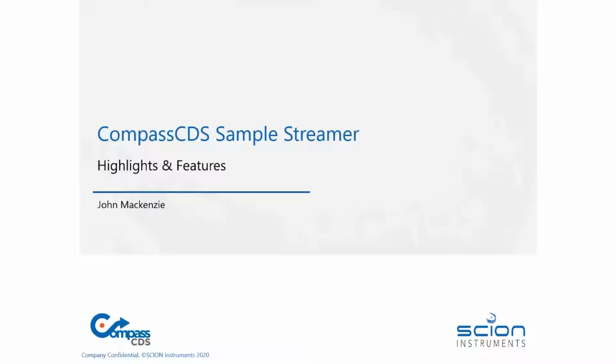My name is John McKenzie. I'm from SCION Instruments. I am the software manager. I look after Compass and MS Workstation and various plugins that are associated with the Compass platform. Today we're going to talk about Sample Streamer, which is an automation tool that we have. It's very useful for getting higher efficiency and higher throughput in your laboratory.